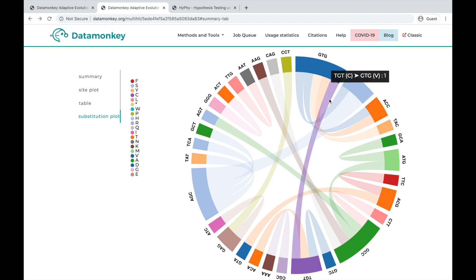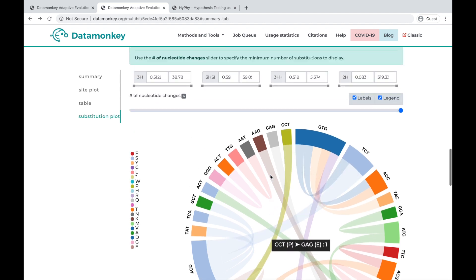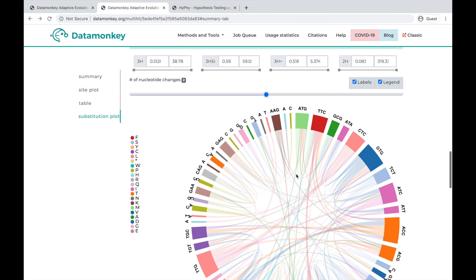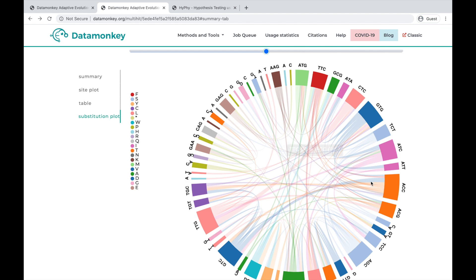So you can highlight and see where the flow is going. You can also change the number of nucleotides that are simultaneously changing. So when we have two, we see there are a lot more changes.